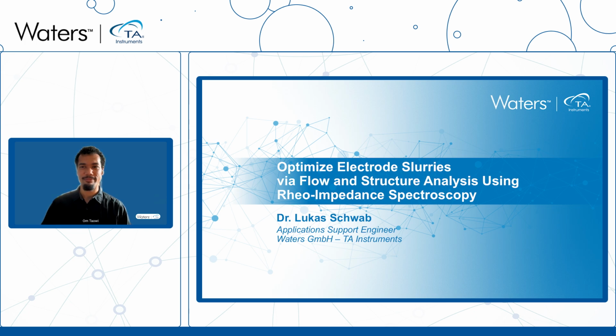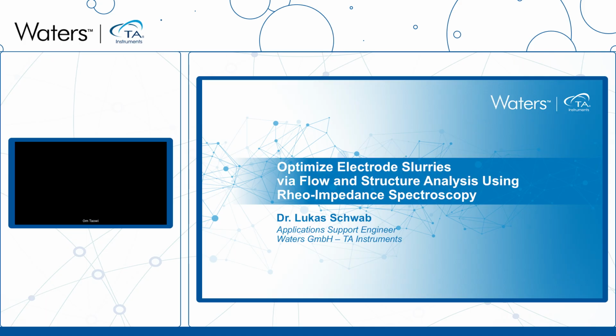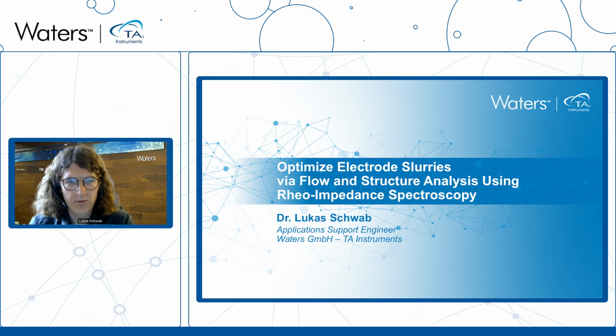Thanks a lot, and also from my side, a very happy welcome to you to this fourth part of this webinar series. In this webinar, I want to show you how the combination of impedance spectroscopy and mechanical rheological testing of electrode slurries can give you deeper insights into the structure of these slurries. So first of all, why is this important?